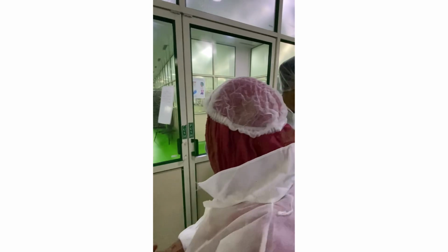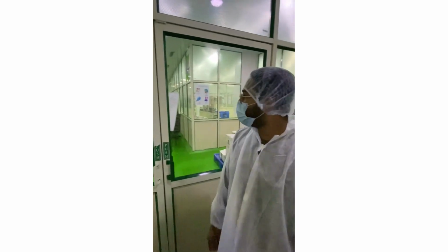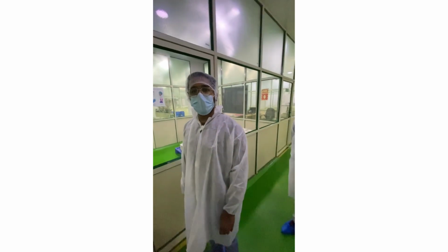Actually, it was running, but due to lunch time we have gone for lunch. So this is our manufacturing unit.